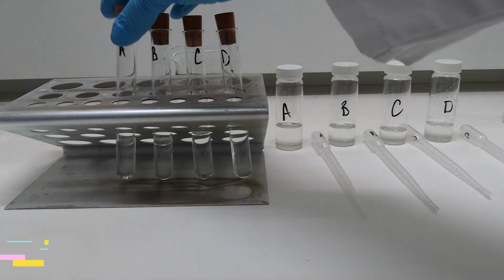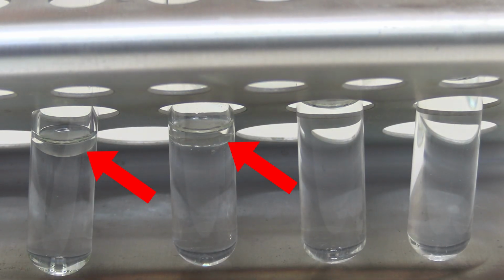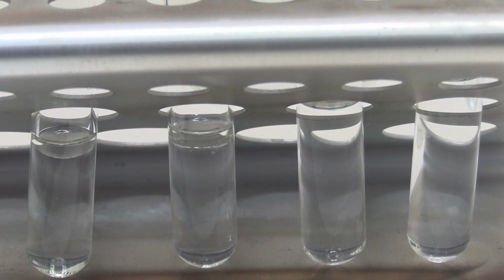We'll then give them a shake and observe our results. If it floats and forms a layer on top, it is insoluble.